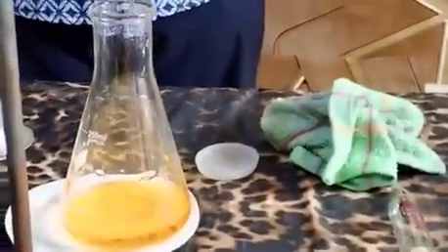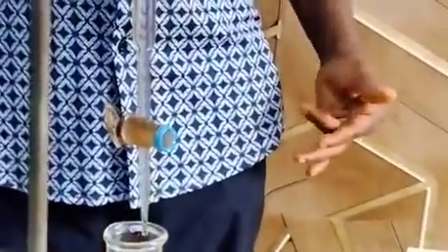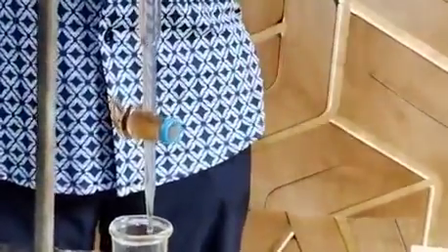I have an idea that it's going to change around 21. So it's going faster. When it reaches 21, I will close the tap from my estimate. So we've got to 21.7 and the whole number before the 21.7 is 21. So reach 21, I'll close the tap and take it drop by drop. One drop is about 0.1 cm cube. So we're moving.